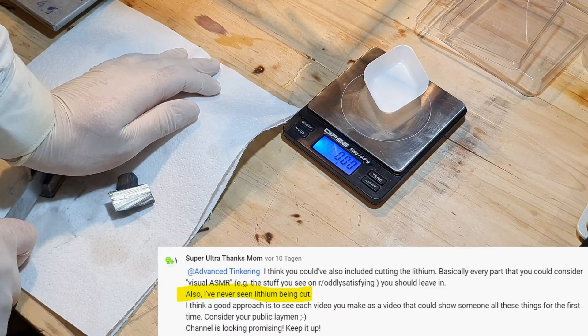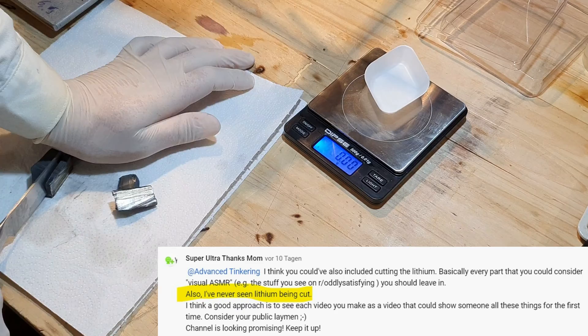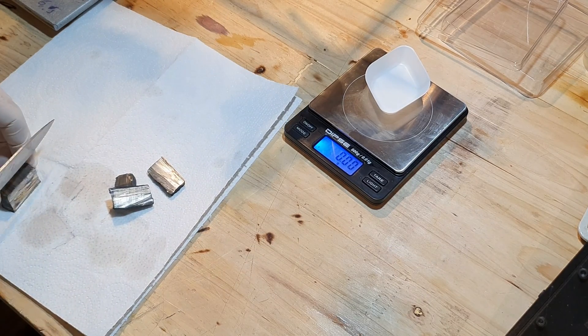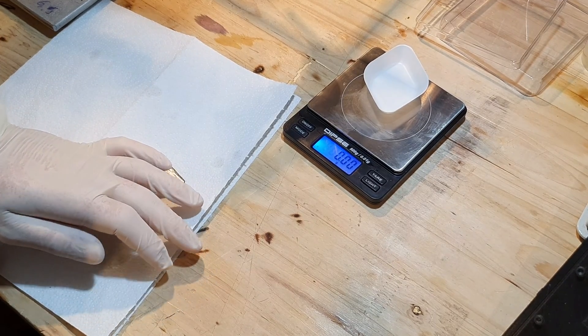First, I wanted to show Super Ultra Thanks Mom what it looks like to cut lithium, since he had never seen it before. Cutting lithium is a lot harder compared to sodium or potassium, but you're still able to cut it with a knife when using a little pressure.